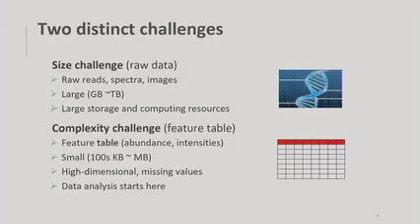This part is mostly what we talk about: stats, visualization, functional analysis. But the first part is critical. If we generate garbage or sub-optimized data, all the downstream analysis is going to be affected. So the raw data processing is critical, but it should be standardized. That's my emphasis, so a lot of you just keep in mind the raw data processing.